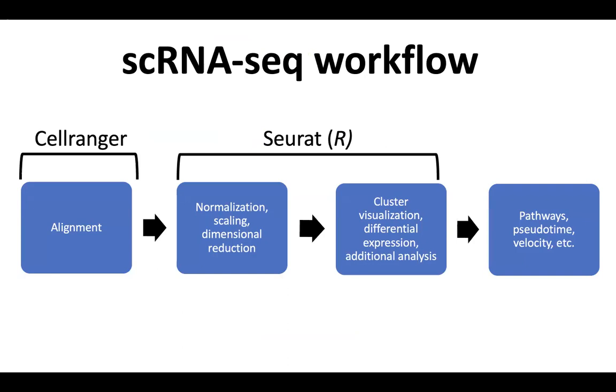Seurat contains a comprehensive set of functions that allow us to normalize and scale and process our data, as well as dimensional reduction of this very high dimensional data set. And then it allows us to cluster and visualize our data, as well as it provides functionality for differential expression, as well as some other additional analyses.